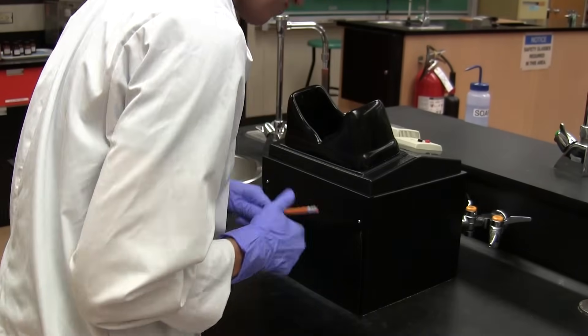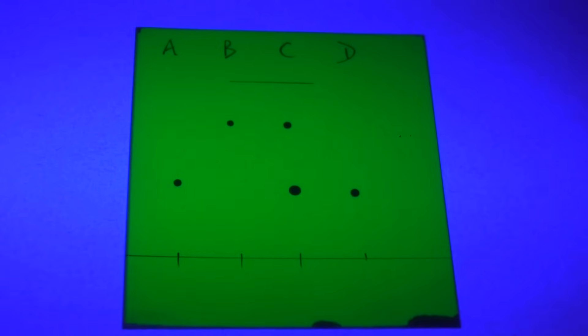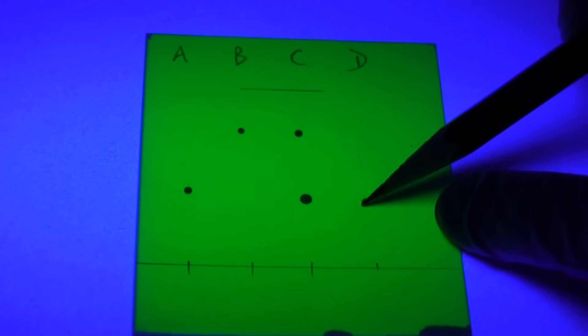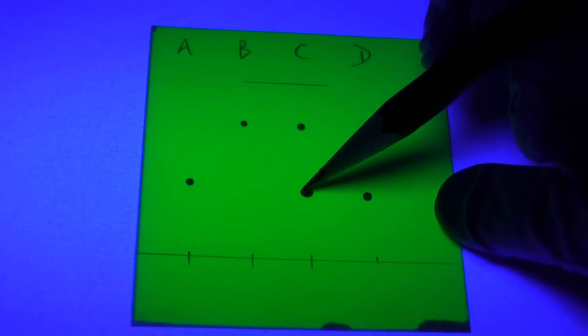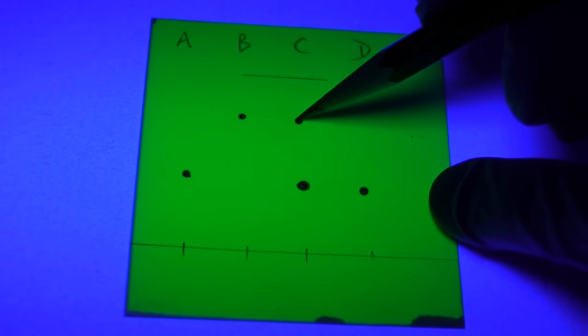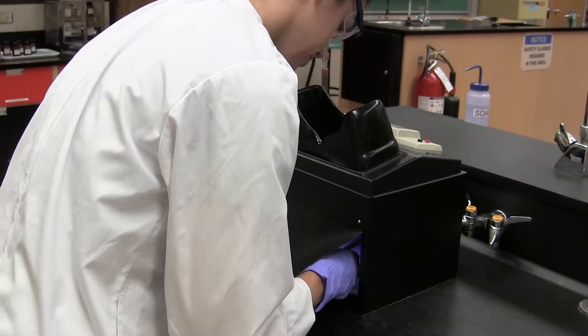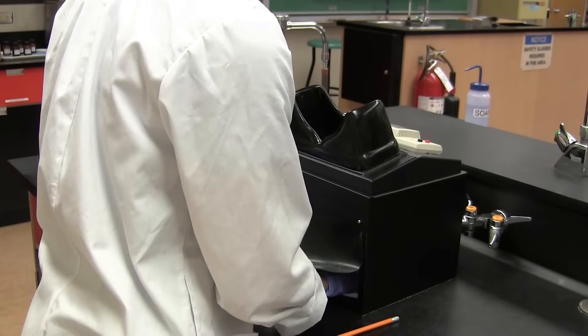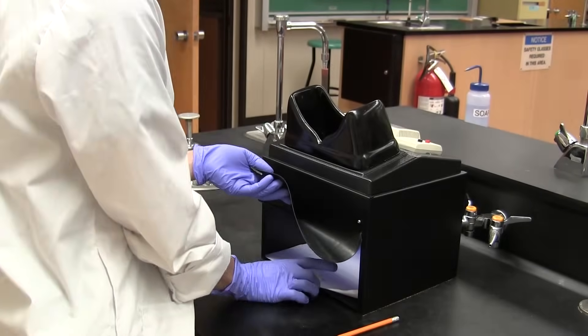So while visualizing the plate under UV, we are now able to outline all the spots with a pencil so that we can locate the spots under visible light. And once all the spots are outlined, we can remove the plate from the UV light box.